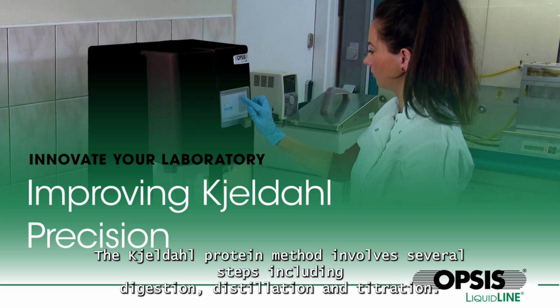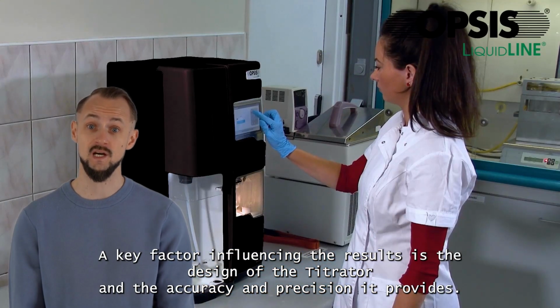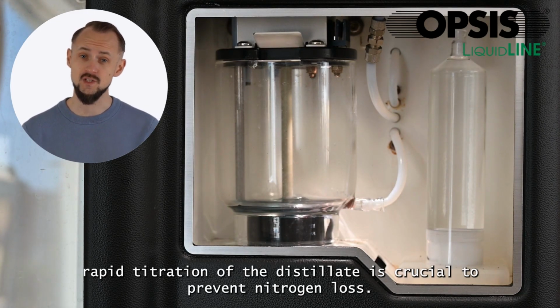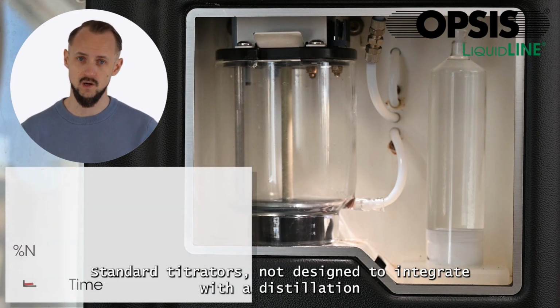The Kjeldahl protein method involves several steps, including digestion, distillation, and titration. A key factor influencing the results is the design of the titrator and the accuracy and precision it provides. As Kjeldahl distillation is a continuous process, rapid titration of the distillate is crucial to prevent nitrogen loss.